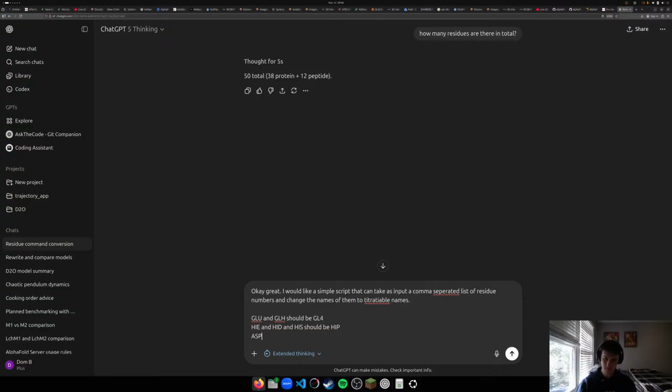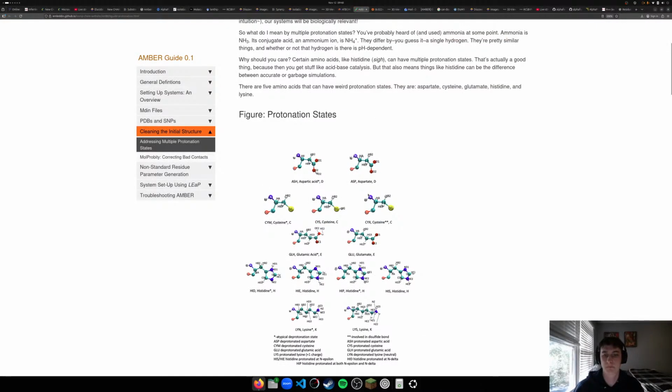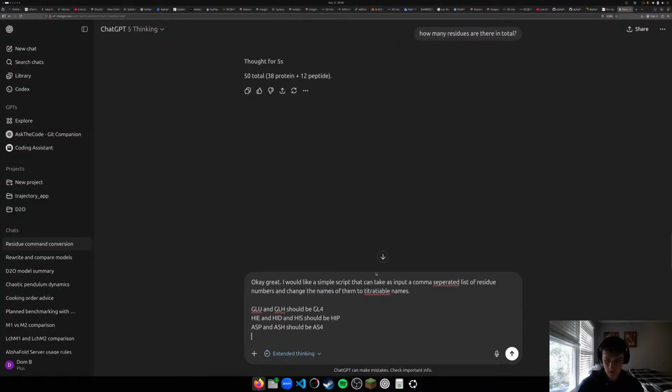ASP, ASH should be AS4. What are the other ones? This should be it. CYM. Oh, I guess LYN too. LYN.